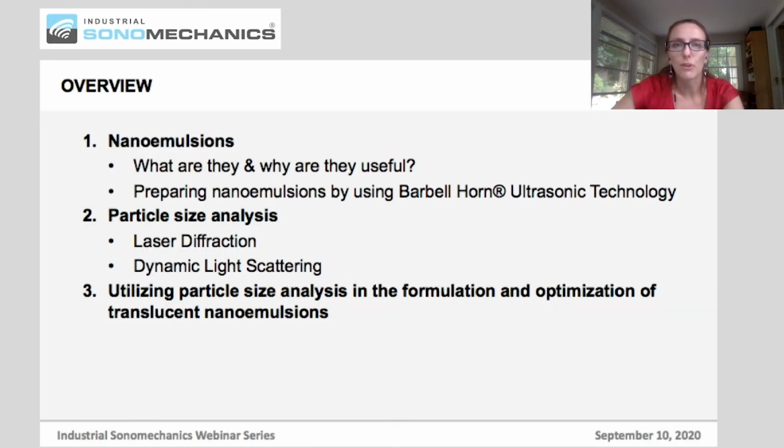Here's also a quick overview of today's webinar. We will go over the ultrasonic nano-emulsification process by using BARBELL horn ultrasonic technology, which is Industrial Sonomechanics' patented technology. We will then discuss droplet size analysis techniques and demonstrate how accurate droplet size determination is essential when high-quality nanoemulsions are manufactured.